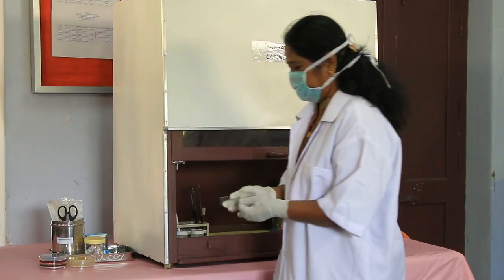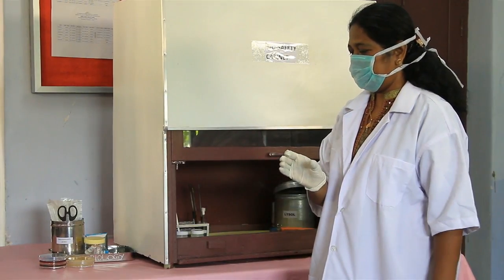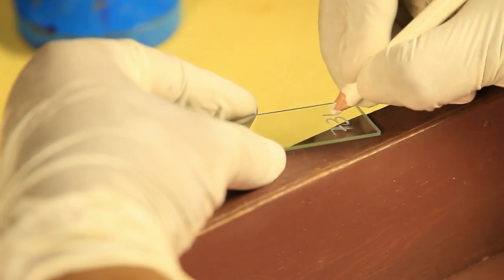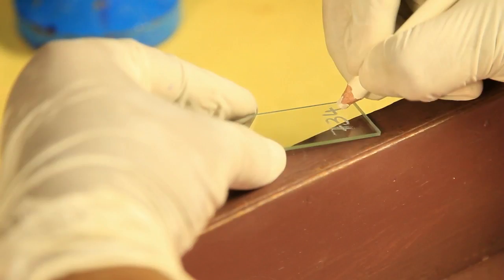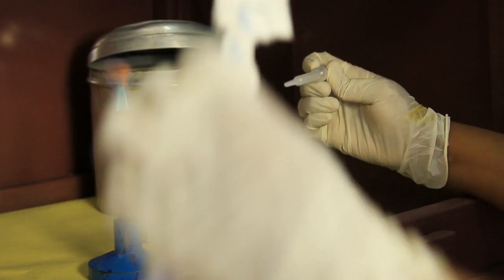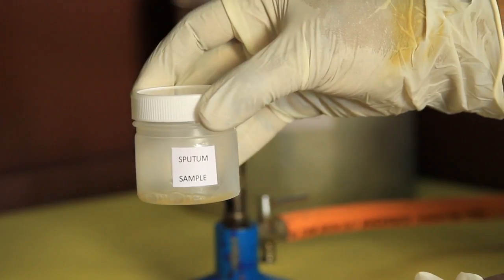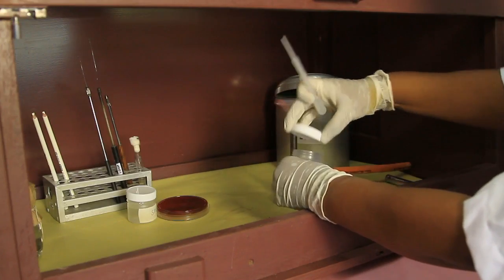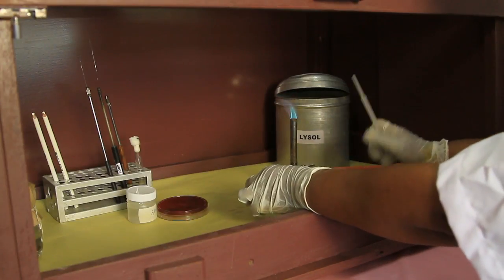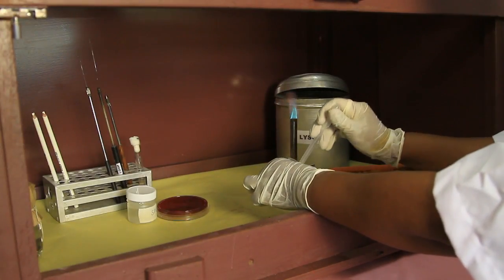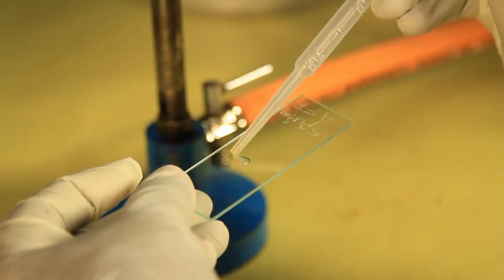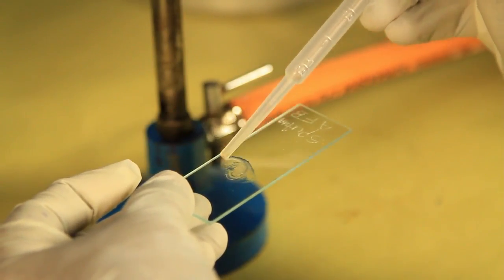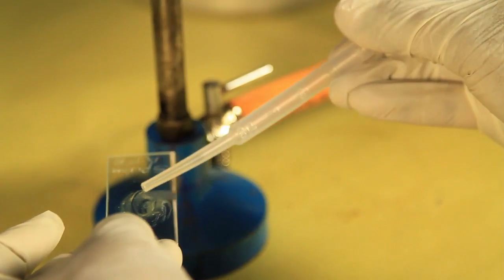For smears directly from the patient sample, take a clean grease-free slide. Label it with patient ID or lab number. With a sterile inoculating loop or dropper, place a small amount of purulent portion of the patient sample, for example sputum, pus, etc., onto the middle of the slide. Spread the sample to obtain a smear of medium thickness. Let it air dry.